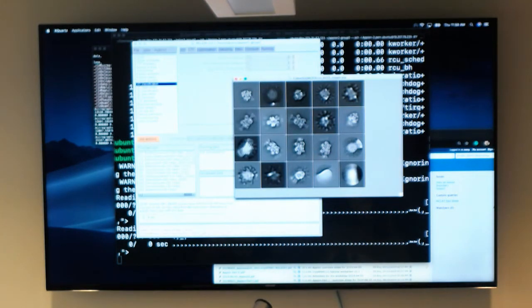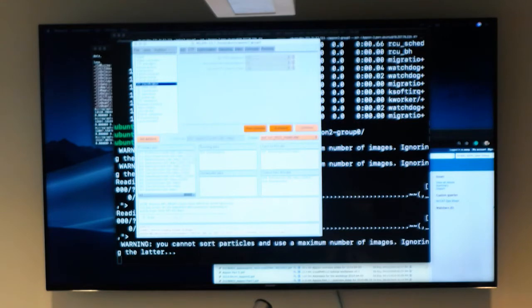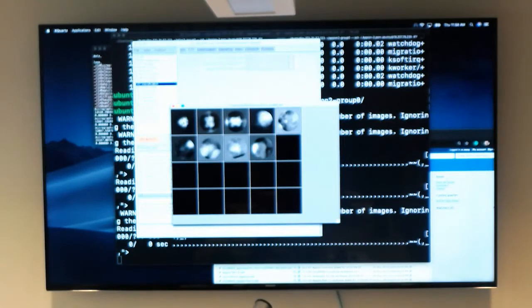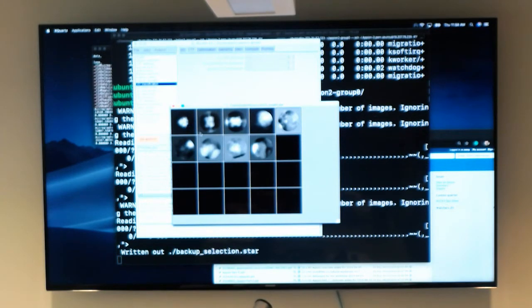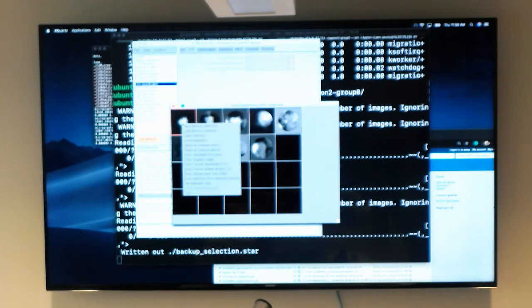But you can see a lot of detail. Okay. So again, something peculiar: if I'm just using a display, I can say, oh, I like a particular class or not, but Save subset classes will be grayed out, because this is just something for display, right?